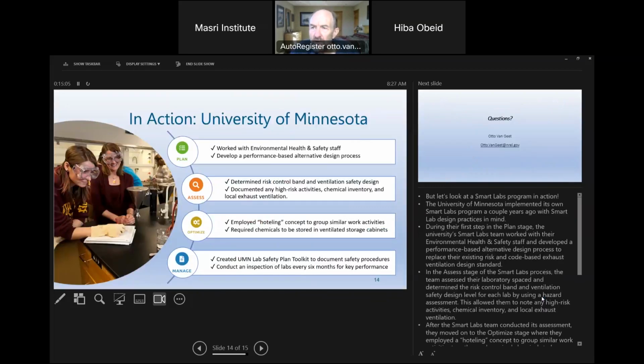And with that, I'll give you one example. We worked with a lot of partners in the United States, but we've actually done this program in other countries also. And there are chapters of I2SL around the world. The example here is from the University of Minnesota in the United States. They worked with their environmental safety and health staff and developed a performance-based alternative design process. From that process, they determined the risk control bands, using the tool that I talked about, and the appropriate ventilation safety design. They documented that and the activities, and documented the chemical inventory and use, all to determine the flow rate in the assess phase.